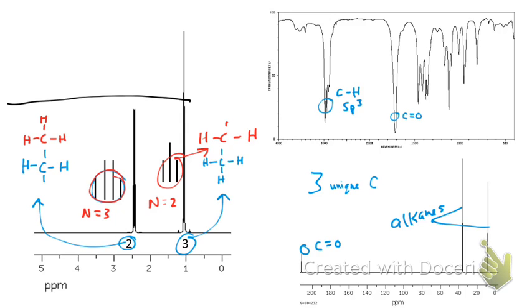1, 2, 1. So that would be 3 peaks. Do you see 3 peaks? Yep. But these aren't really the same magnitude. You'll always see a shift in the height. Actually, and this is another tip: if you draw a line connecting those, it's angled in that direction. They're always angled towards the one that split them. Okay. So these two split each other. But yeah, the exact peak height is always questionable. You just kind of have to approximate. Okay. Thank you. Yeah, that's nice stuff.